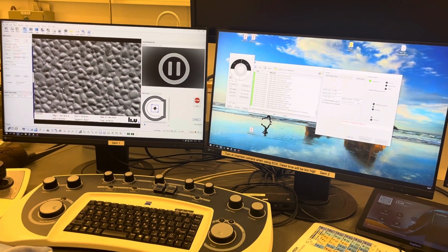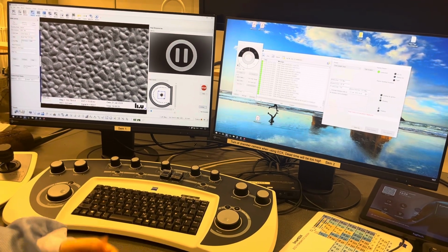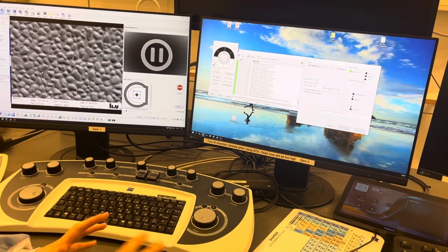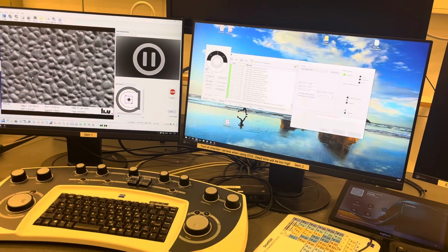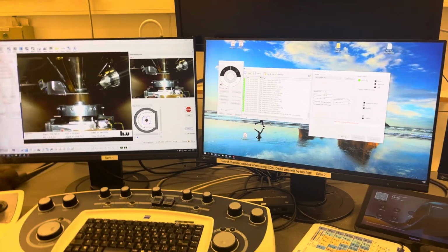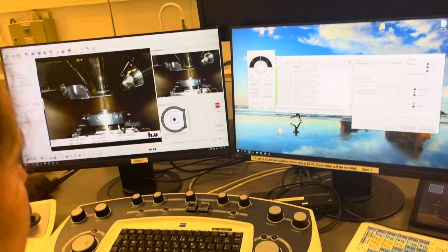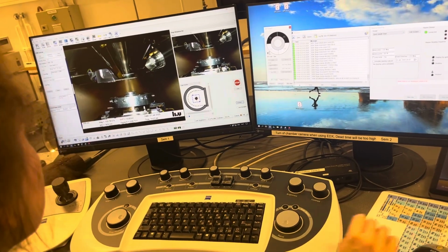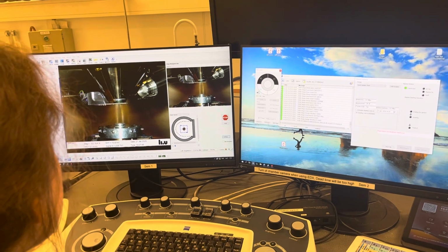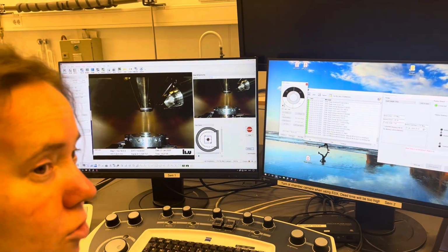Whether it's as useful for your samples, I'm not sure about it. It's mostly used for the steel samples, and it's mostly used for getting this crystallographic type of contrast or material contrast. Yeah, so then after you finished with this, again, lower your stage for safety, and then you click BSD out. It puts the sample down, and it takes out. So this is the backscattered imaging.